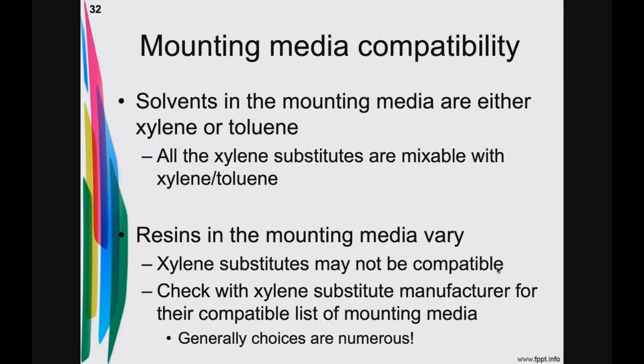Currently now, you're probably up to a choice of at least 20 different mounting medias. So your choices right now are much more open for you. But as you go and look at a xylene substitute, you need to check with the manufacturer and find out if the current mounting media you are using is compatible with it.